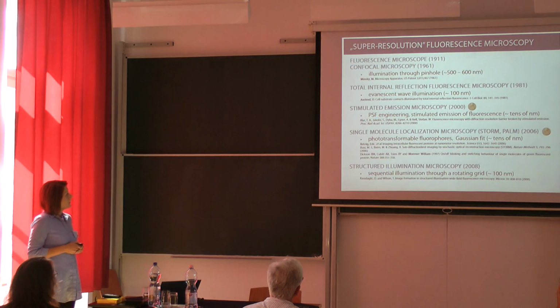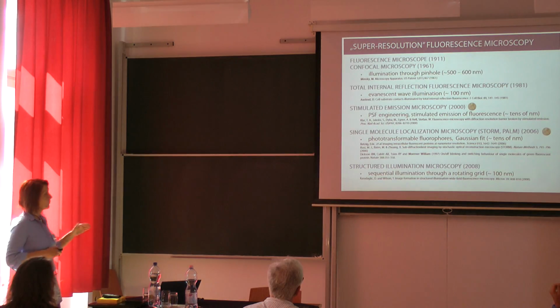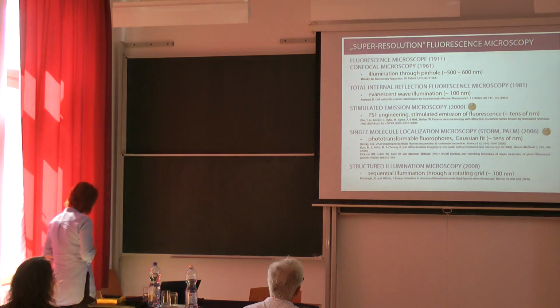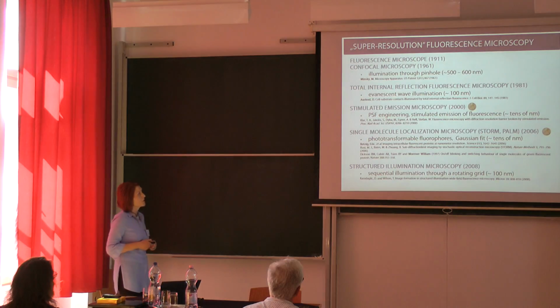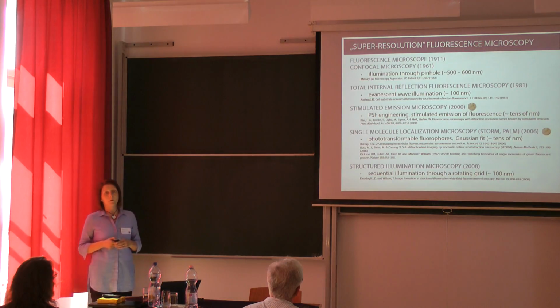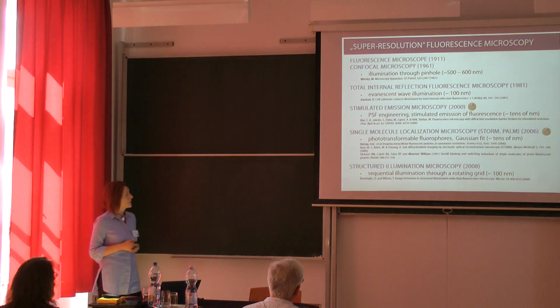So the idea is to image individual fluorescent molecules with quite low density, and then fit the image of these individual fluorophores with a Gaussian function to be able to localize the exact XY coordinates.